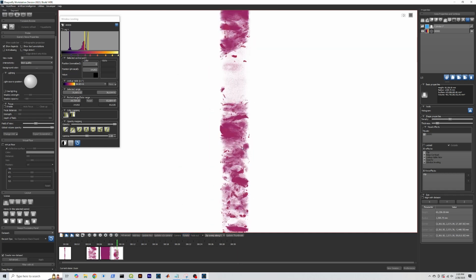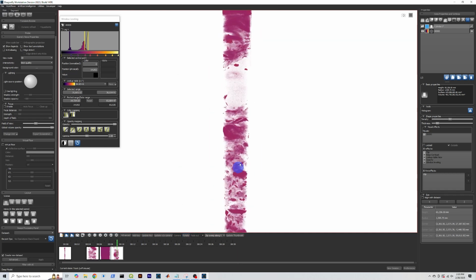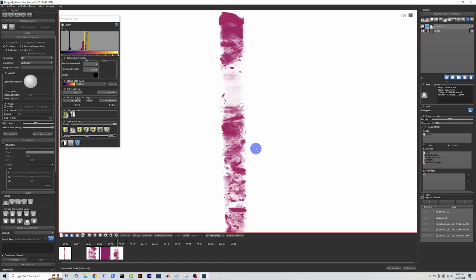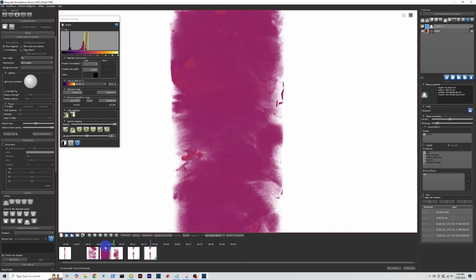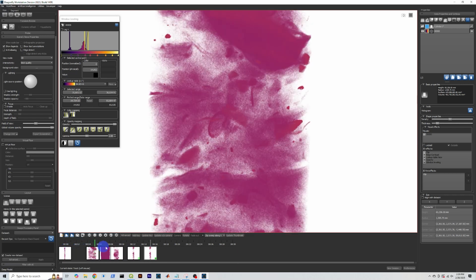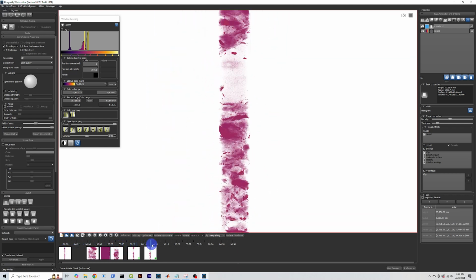And so if you've lined this up perfectly, and I have not, if you've lined this core up on a given axis, let's say the z-axis, right? You often want to rotate this on the z-axis. Let's just add a key right here really quick. You can now rotate along those axes. And let's click that. Yeah. And then it will automatically rotate that 360 degrees for you. So that is one way for you to make a pretty cool multi-stage video of your three-dimensional data.